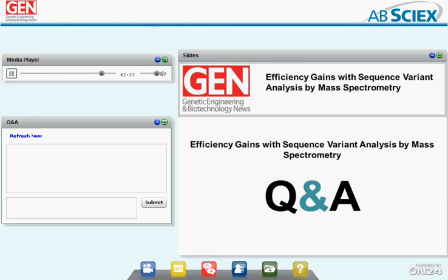And St., we have a very direct question here. Did you imagine you could have done this kind of work a few years ago? So for a lot of people, this was extremely challenging, and certainly the cases of multiplying the amount of information to search through was huge. There are two things that have probably made this very much more achievable in recent years. One of those is having very fast MSMS. That's allowed the sequence of the peptides to be found more easily in general.